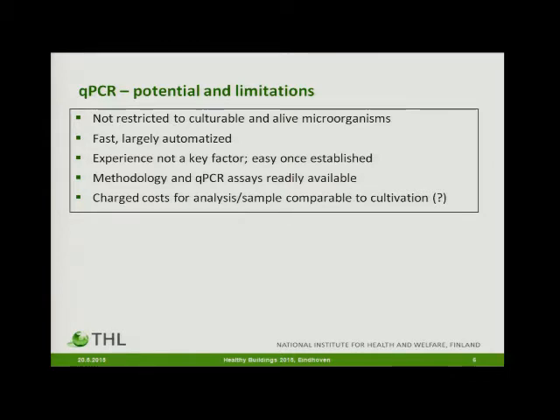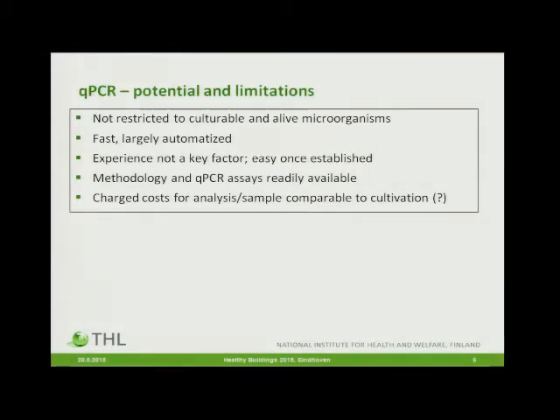At least I think we are happy that we are not restricted to only see what grows on our agar media, but that this method is not restricted only to culturable organisms. We also see non-alive microbes, so dead material that accumulates on surfaces, and I think that's a discussion. Do we want to see only active growth or everything that is there? In terms of health, we know that also dead cells matter, so that's one argument.